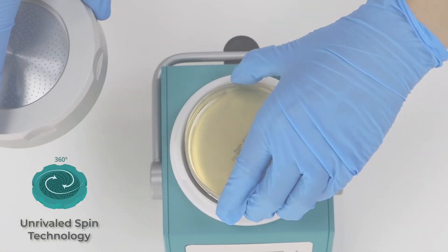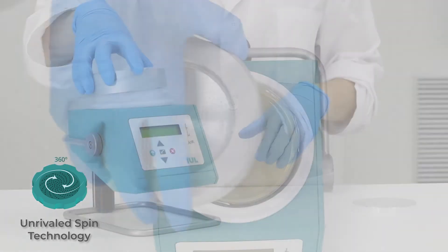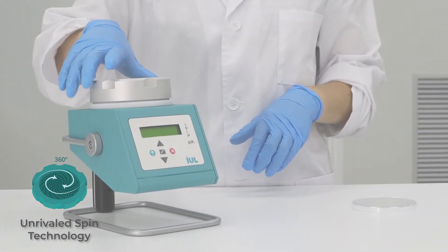Spanair stands out from the rest. With the rotatory system, microorganisms stay on the plate in spiral and regular distribution.